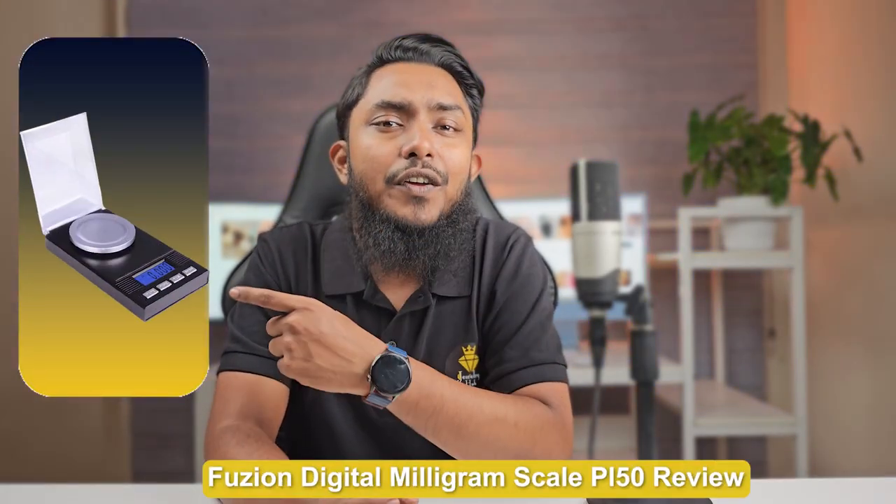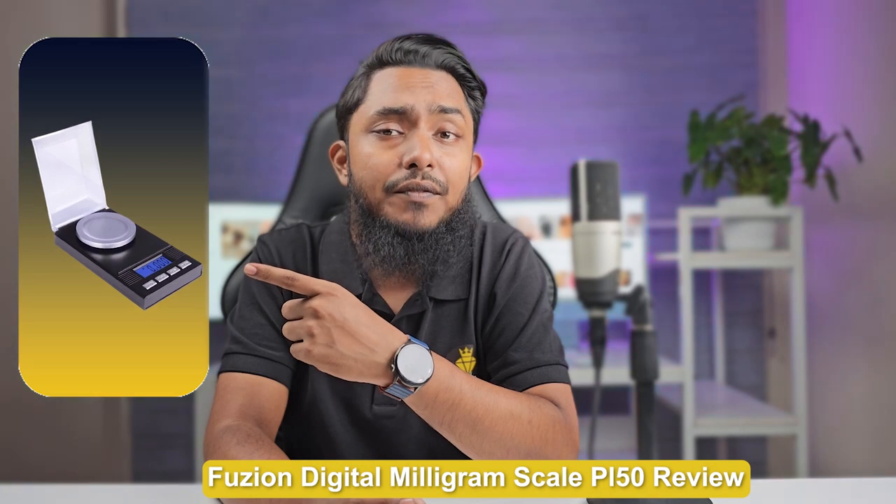Welcome to today's video where we will be taking a closer look at the Fusion Digital Milligram Scale PL50. If you are in need of a reliable and accurate scale for your weighing needs, this review is for you. Join us as we explore the features, specifications, and pros and cons of the Fusion PL50. Let's get started.